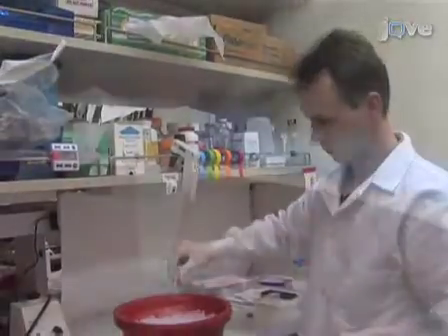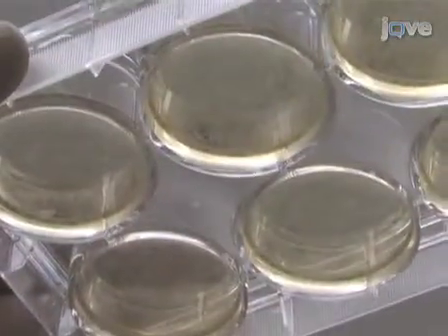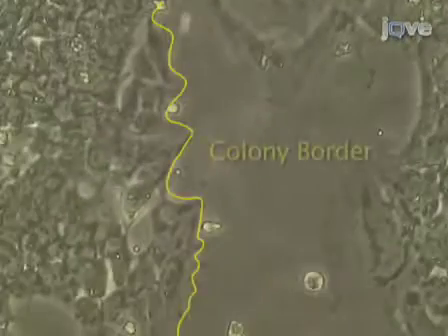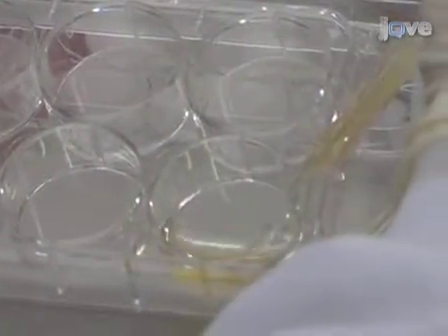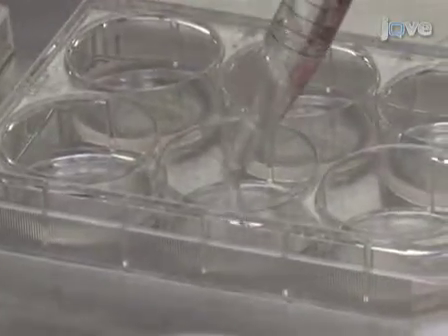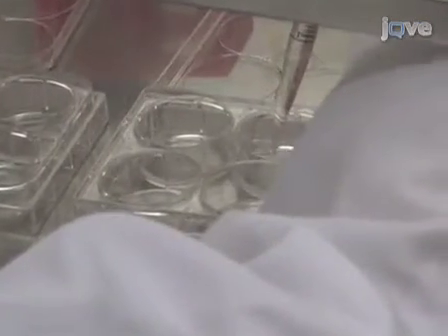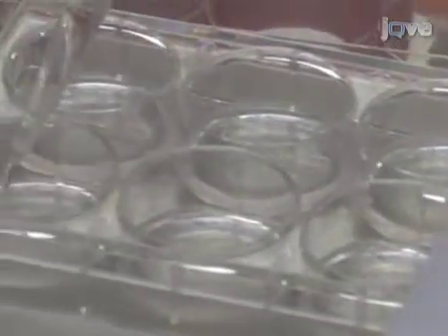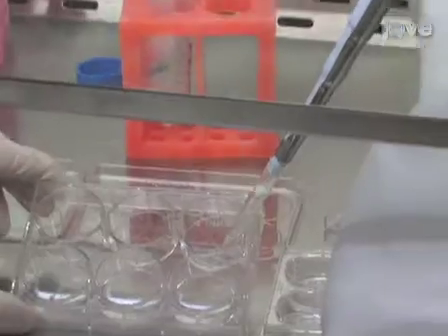The first step in this procedure is to isolate mitochondria from human embryonic stem cells. For this assay, we will use human embryonic stem cells grown on a matrigel-covered plate in a feeder-free condition. In order to collect mitochondria, we start by washing them with warm 1X PBS pH 7.4 and then trypsinize the cells for 5 minutes. You can use 1 ml of 1X trypsin per well in a 6-well plate. After 5 minutes, stop the reaction by adding an equal volume of fresh trypsin inhibitor, 1 mg per mL in 1X PBS, and harvest the cells.